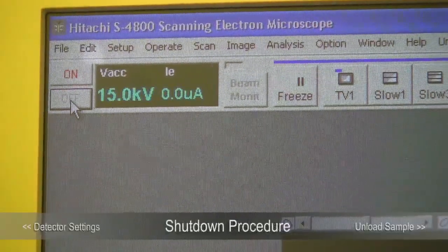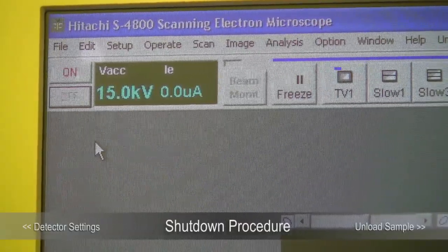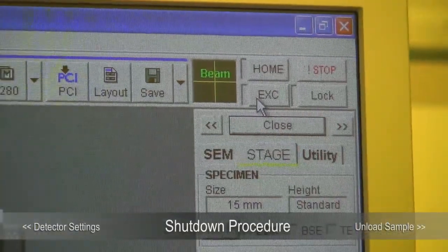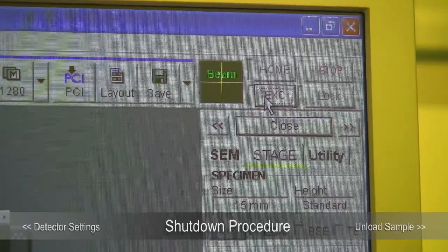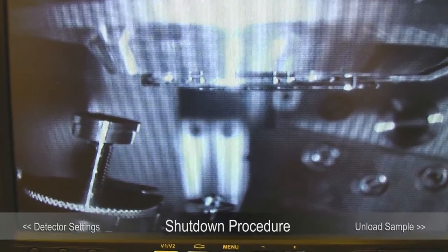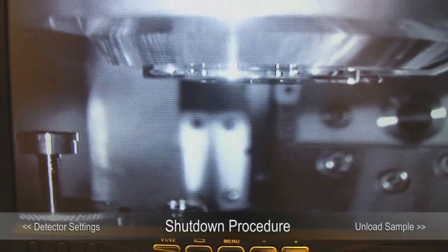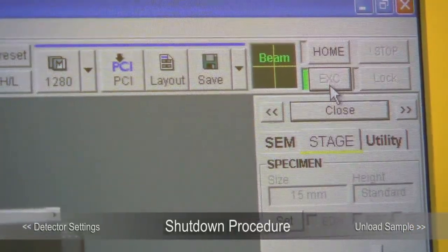The shutdown procedure is to turn off the high voltage — click Off. Right after you click Off, the program will freeze for a few seconds, so wait about five seconds. Then move to the exchange position by clicking the EXC button. When the stage is very close to the exchange position it will appear to have stopped, but it's parking very slowly. Don't rely on the monitor to tell whether the stage is at the exchange position — watch the computer and wait until it stops flashing before you try to unload the sample.